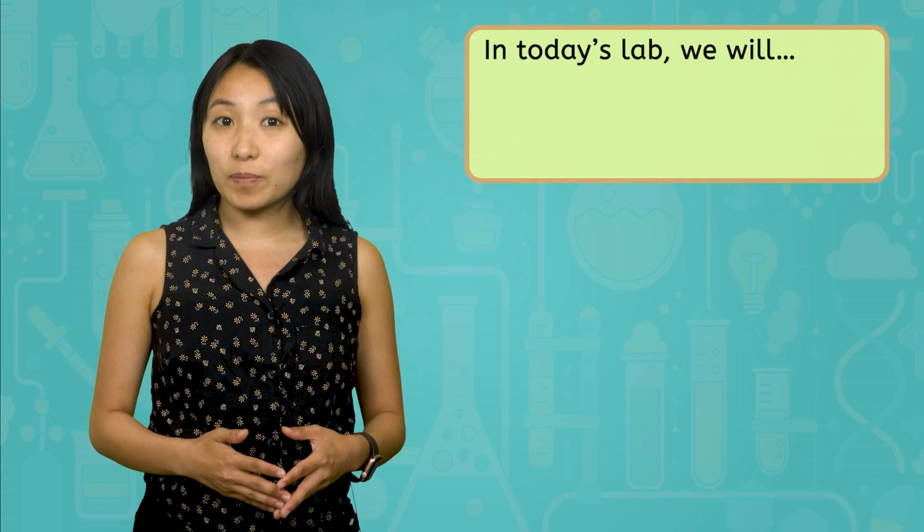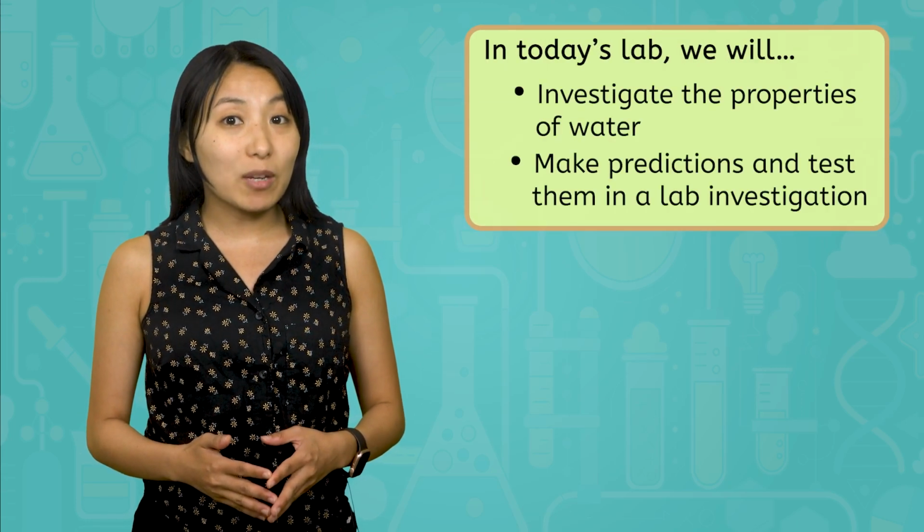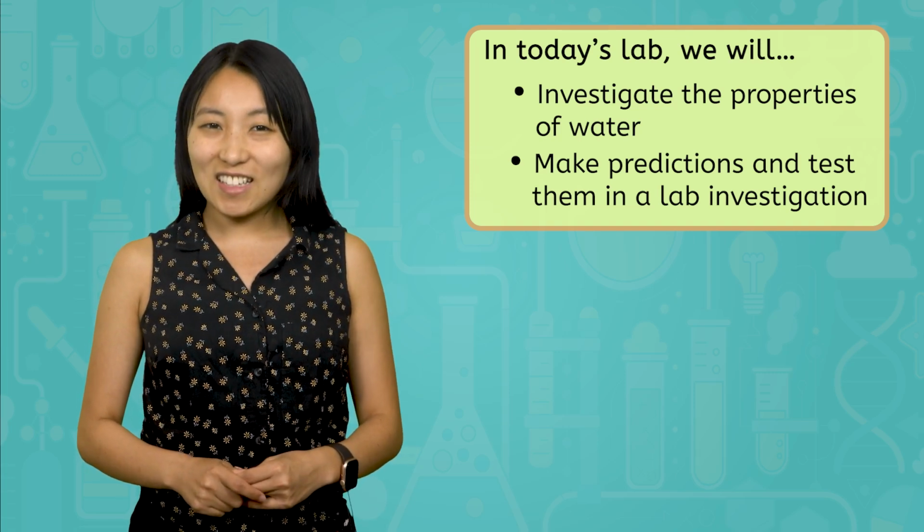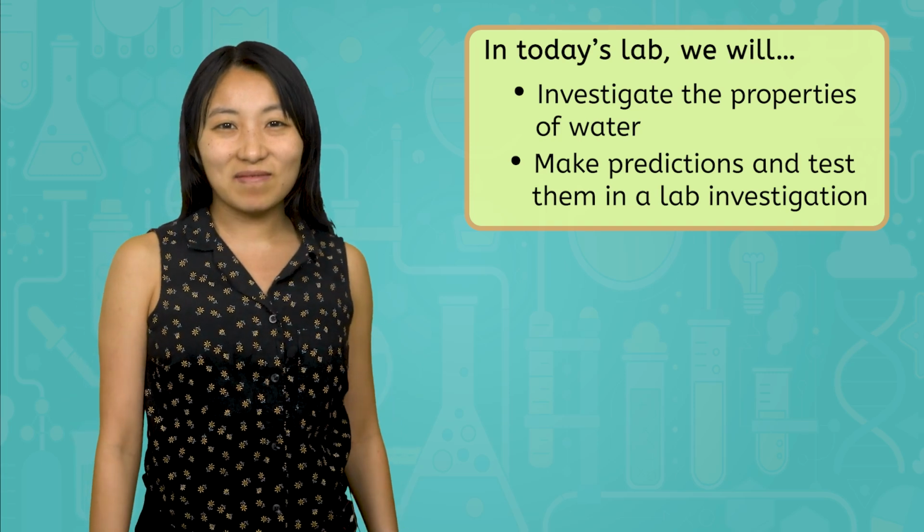The answer, or solution, might surprise you. In today's lab, we'll investigate the unique properties of water. Then we'll use what we've learned to make predictions and test them in a lab investigation. Ready, scientists? Let's get into it.